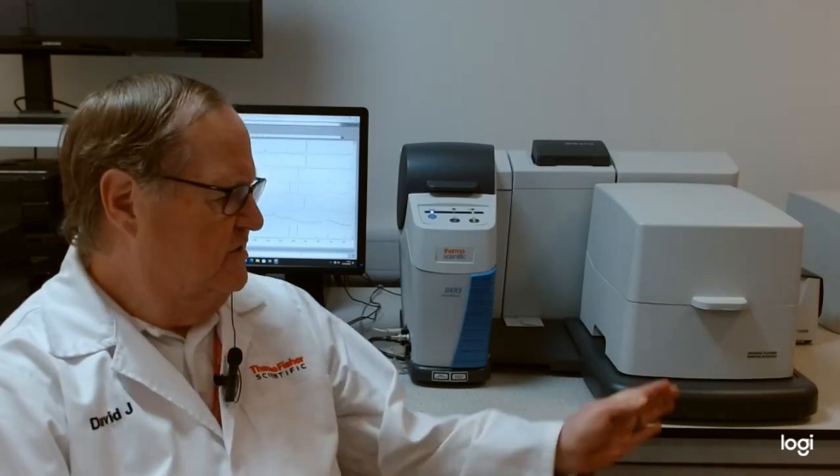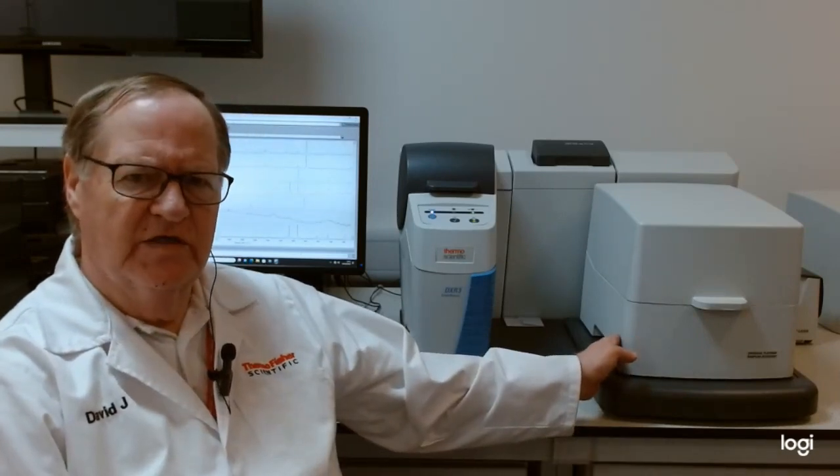As far as sampling is concerned, a range of accessories and modules are available for the Smart Raman, which gives it great flexibility. The standard sampling interface is the universal platform sample stage, which is the system that is actually installed on the instrument at the moment.